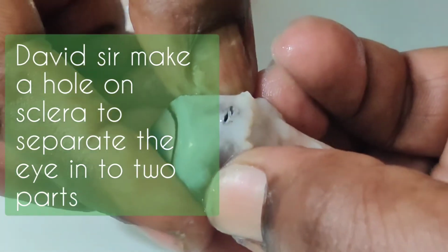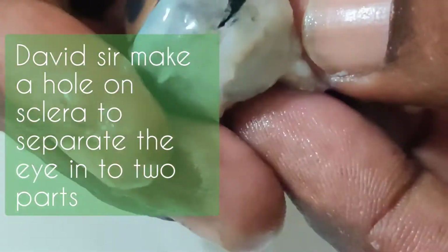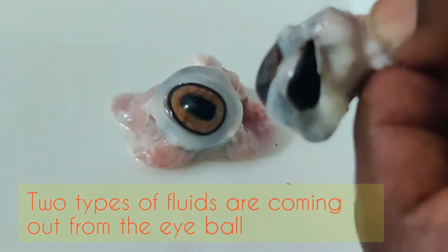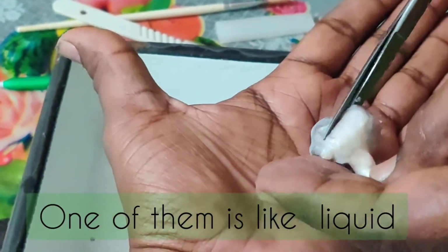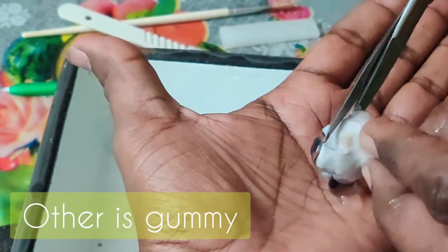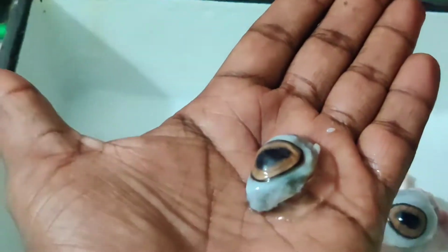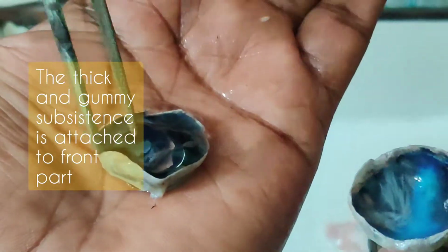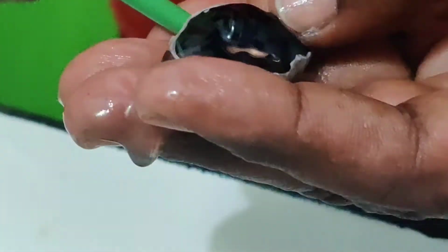David sir makes a hole on sclera to separate the eye into 2 parts. Two types of fluids are coming out from the eyeball. One of them is like liquid and other is gummy. Now the eye is separated into 2 parts, anterior and posterior parts. The gummy substance is attached to the anterior part of the eye. Observe it. The posterior part of eye is looking empty.